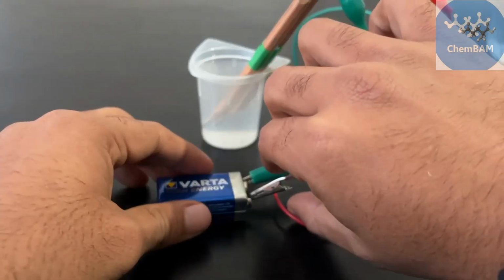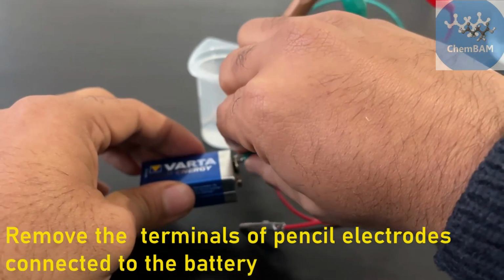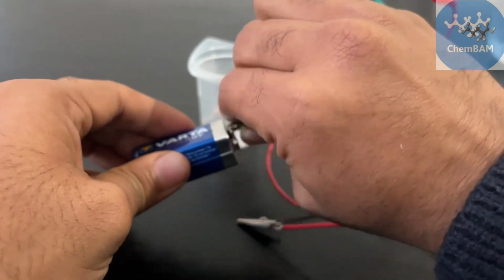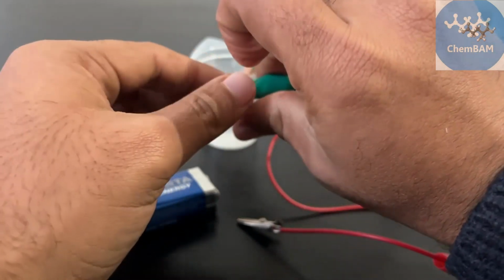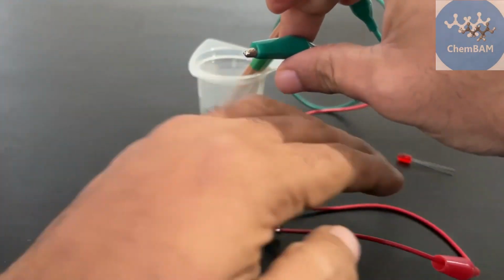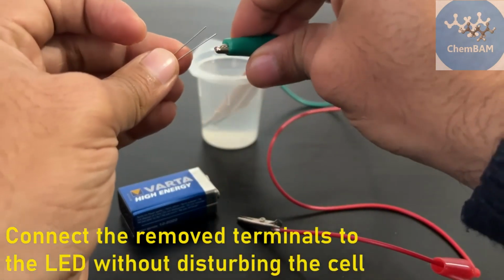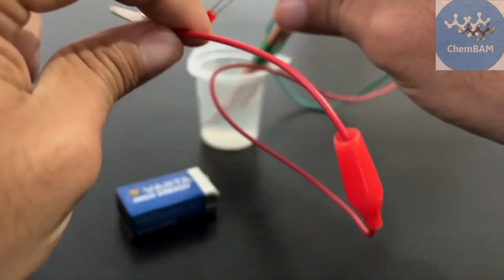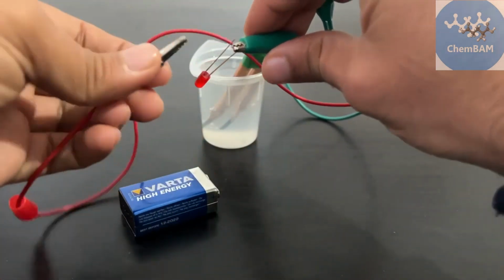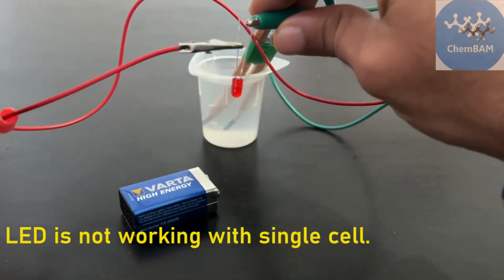Now, disconnect the pencil electrodes from the battery and instead connect them to an LED, keeping the rest of the cell exactly the same. The LED doesn't seem to work when a single cell is used, so let's try connecting it to 3 cells.